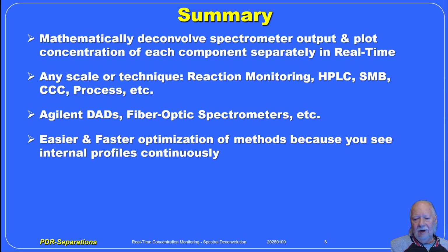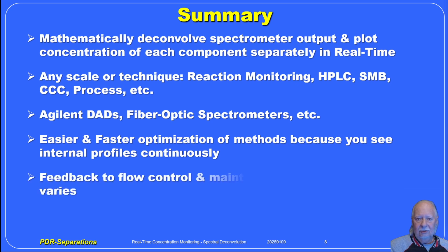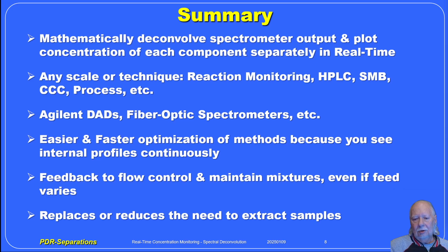Makes easier and faster optimization of methods because you see internal profiles continuously. With feedback to flow control, you can maintain mixtures even if the feedstock is varying. You can replace or reduce the need to extract samples.